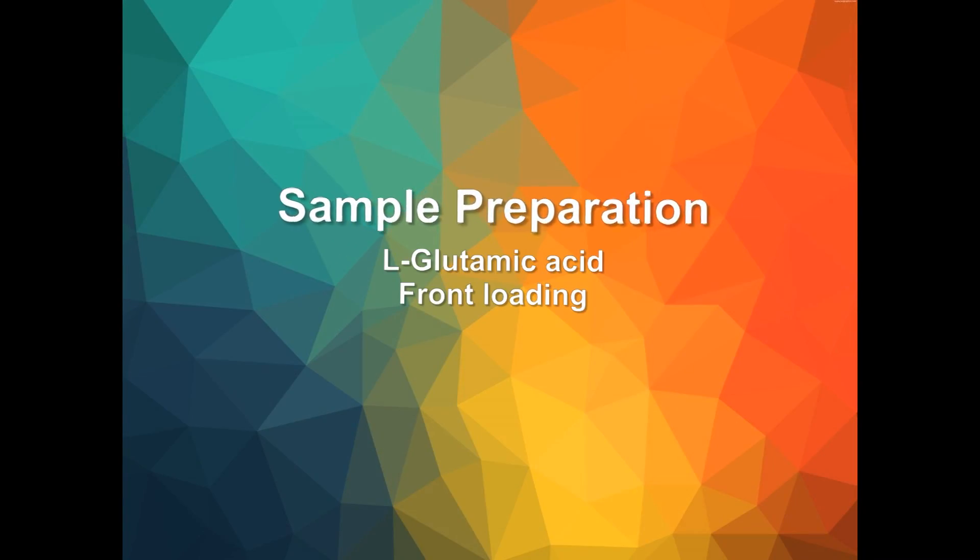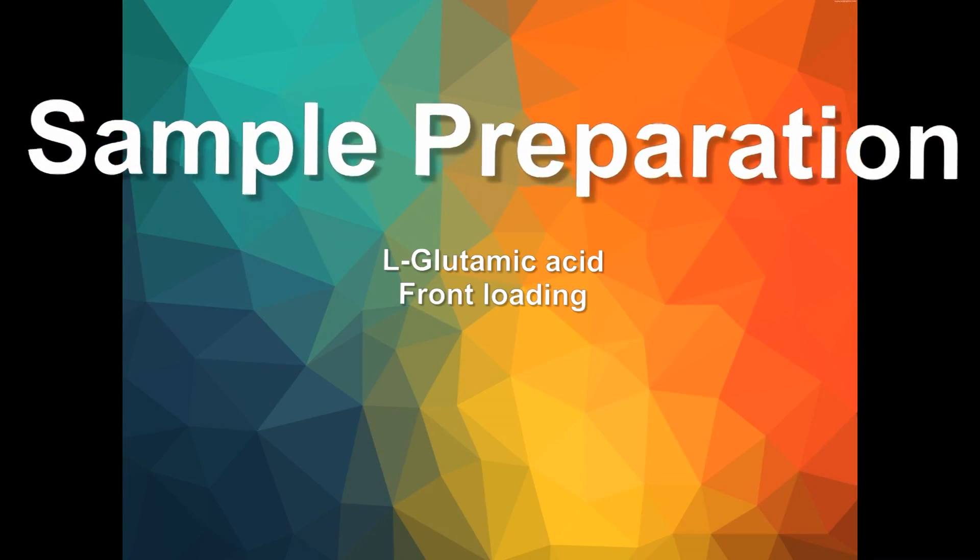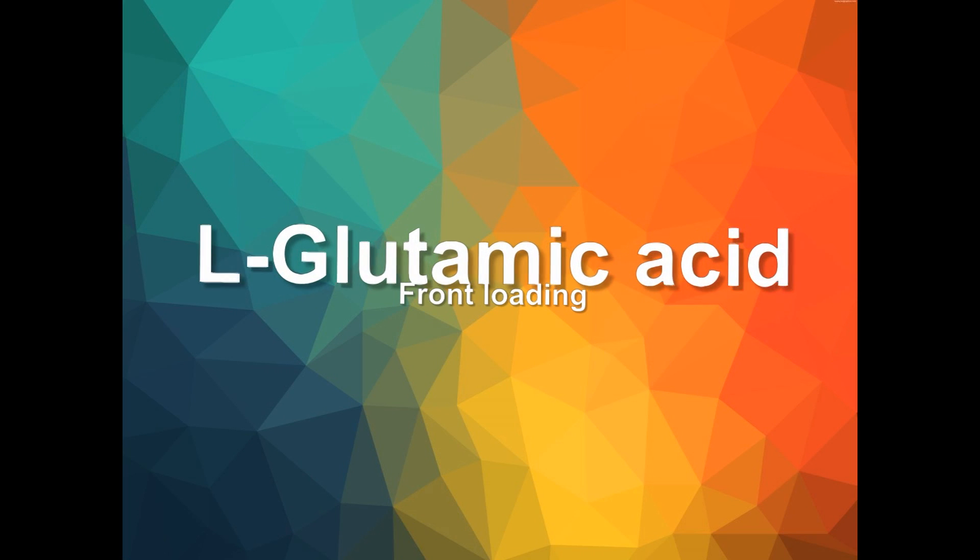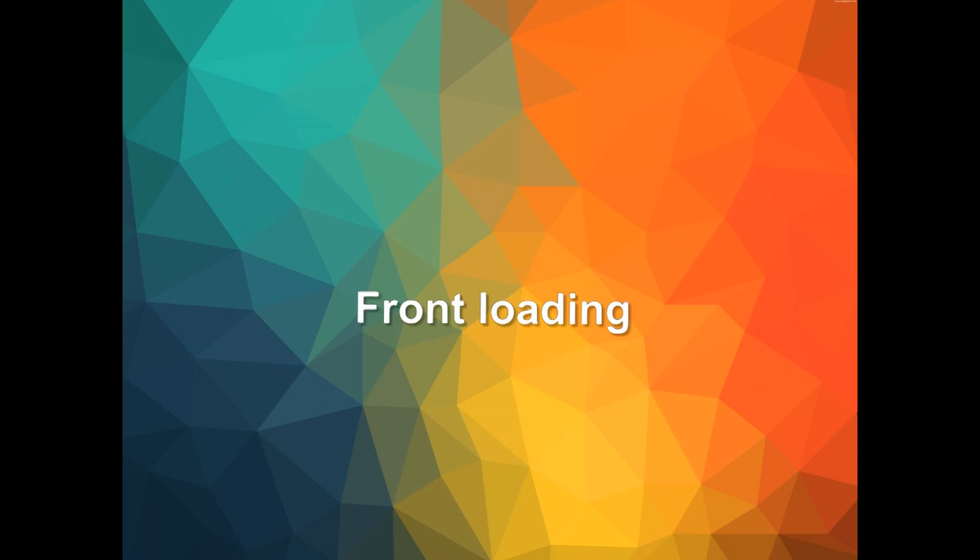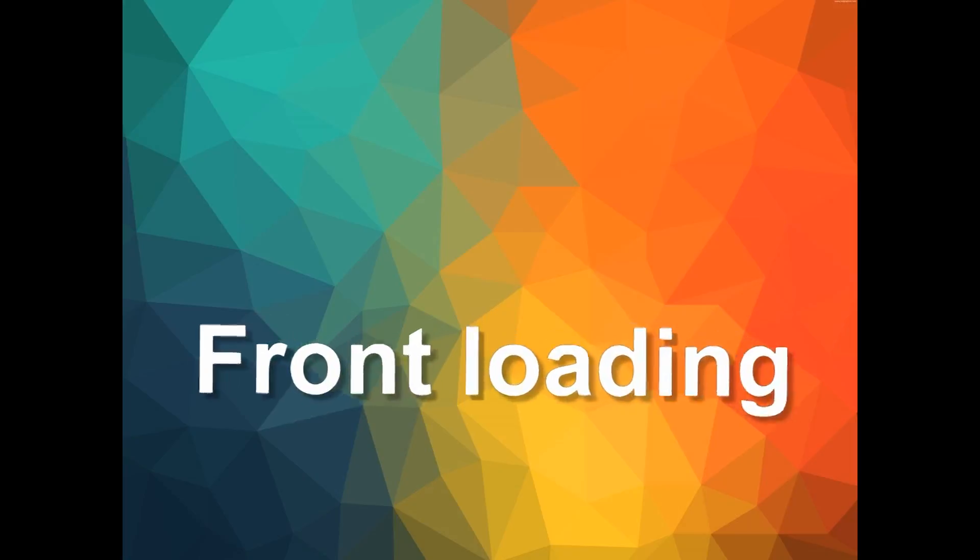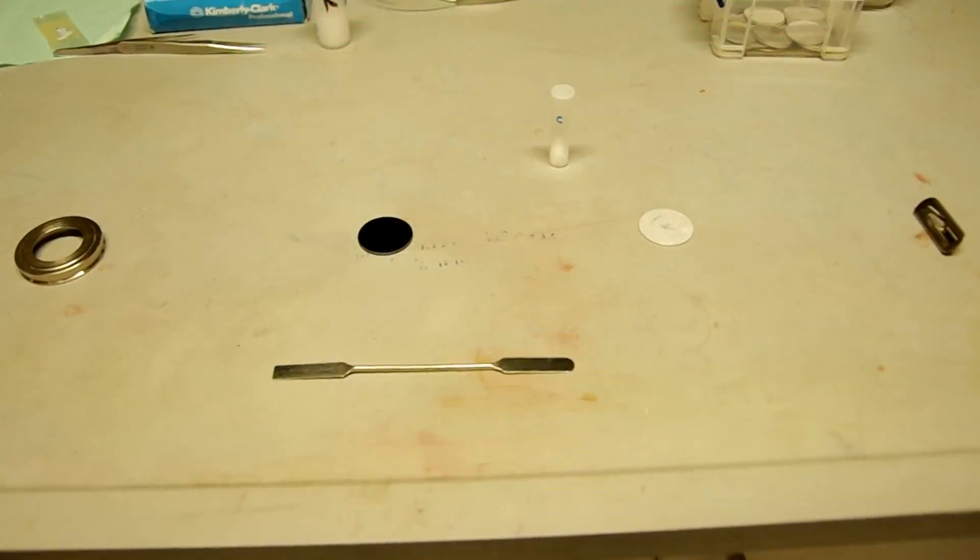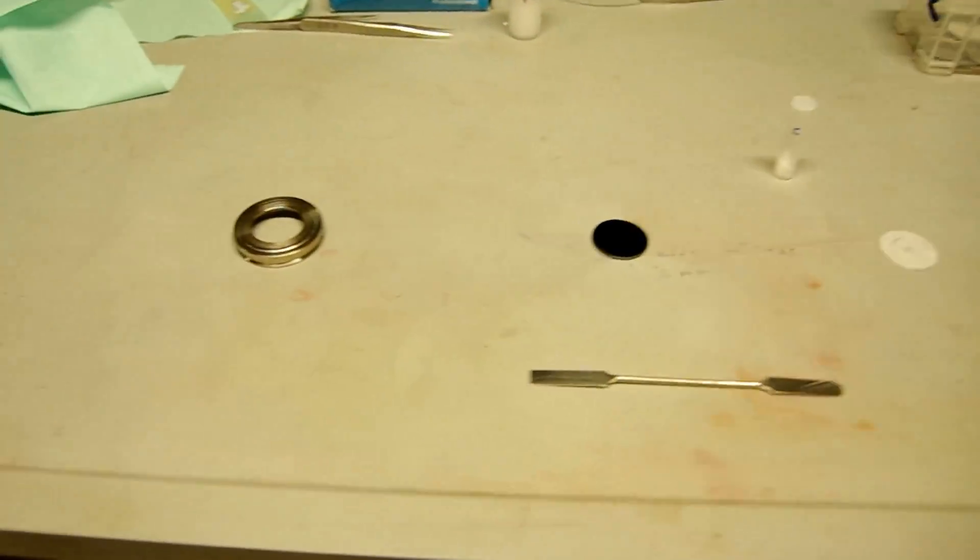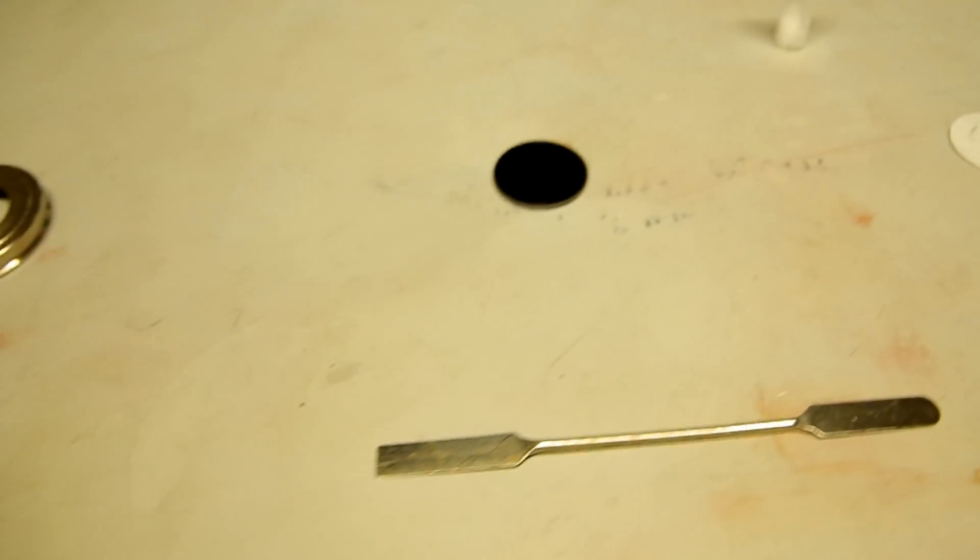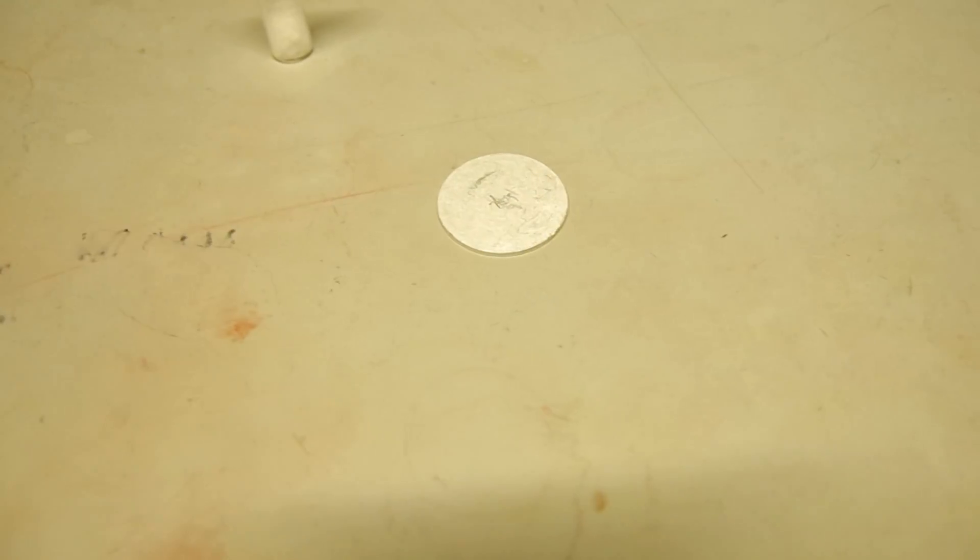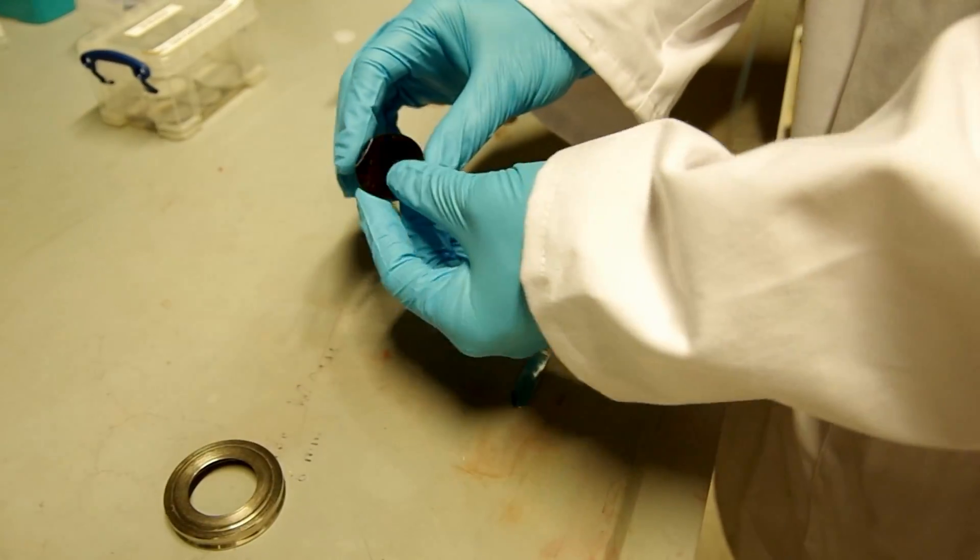Now, let's look at the sample preparation. The sample we use here is L-glutamic acid. The powder is quite fine, so no milling is needed. For front loading powder mount, we need standard sample holder, monocrystalline silicon zero background, a spatula, metal base, and a clip.